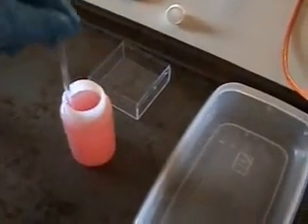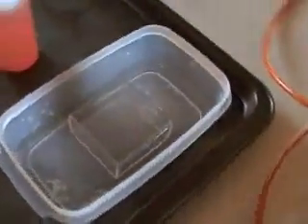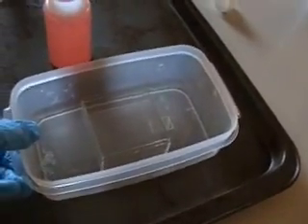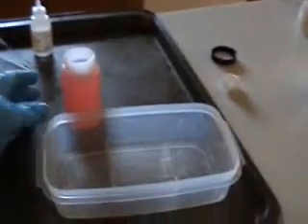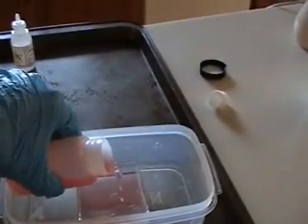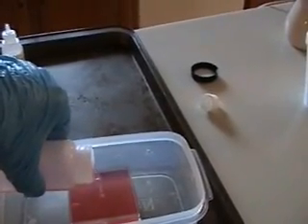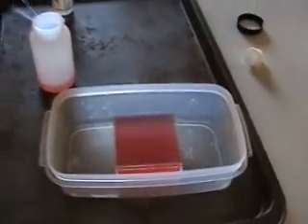I'm going to go ahead and take out the stirring rod, and then attempt to pour it in. Now I'm going to put it in another container. I'm going to pick up that plastic container, this one, and transfer it to a different location where it's not been disturbed for 12 hours. Now let me see if I can film this and do it at the same time. Now remember, the material, the agar, is hot, so you want to make sure that your hands are not overheating. There we have it.